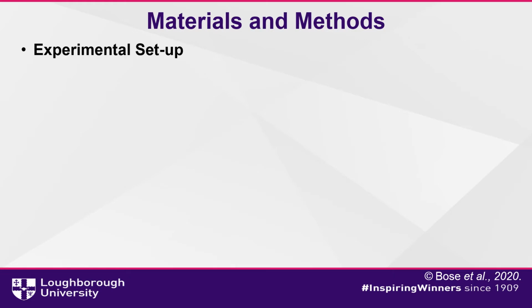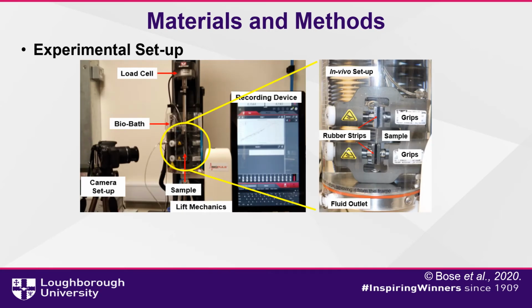Materials and methods. Experimental setup. The whole experimental setup with the biobath system is exhibited in this figure. A camera was placed perpendicular to the samples so as to record the changes in the deformation behavior during the entire process. A zoomed-in view of the grips is also shown.